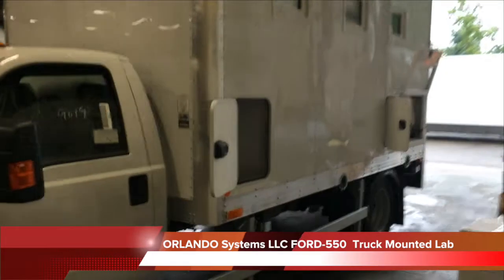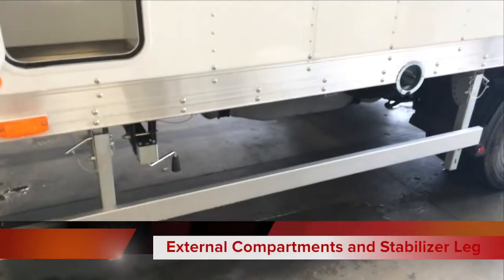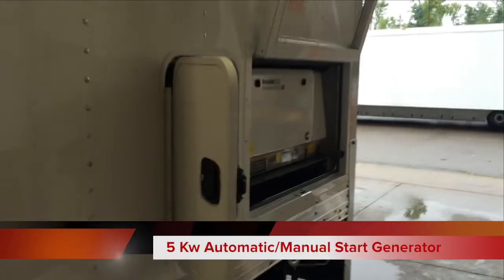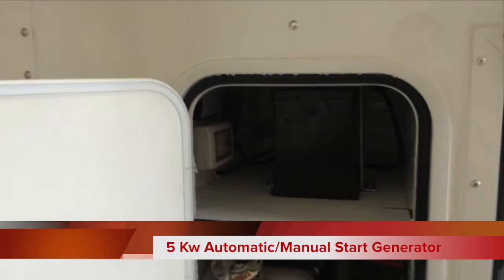Exterior features include a storage compartment for the sterilization unit, underrun protection for ECE requirements, folding landing gear, a 5KW generator, fuel tank for the generator, and battery for the generator.